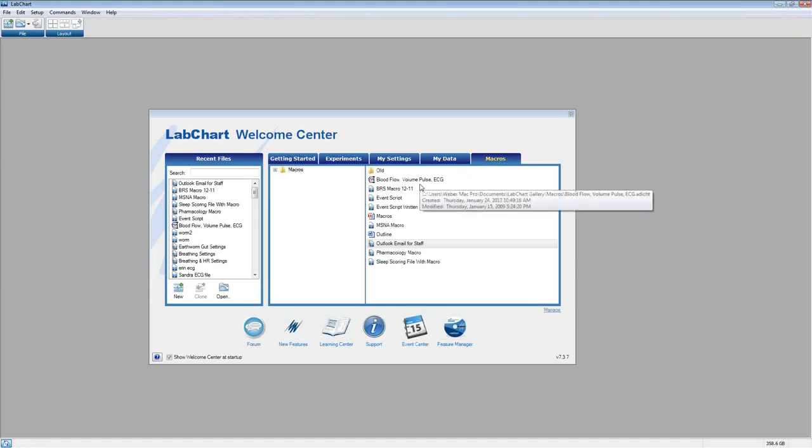So that's really what we wanted to show you today. Some different options and different features in macros, some different things you can do, and some of the new things you can do. So at this point, that's what we really wanted to get through and show you guys.